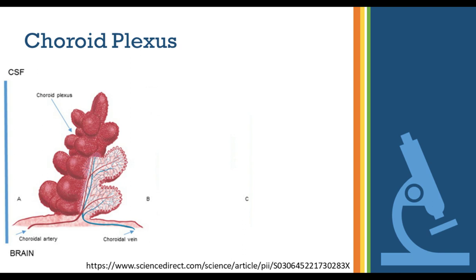Dr. Delery, can you elaborate on why you couldn't use human choroid plexus? That's awesome. Okay, so you can't use human choroid plexus because the only samples I get, I don't really know anyone out there who would voluntarily submit to an open brain surgery where we would remove pieces of their choroid plexus. And they do actually have, I believe, a human line out there. However, it was taken from a patient who had cancer in his choroid plexus, and that can affect growth rates of the cells and behavior of cells. So we didn't want to use that just because it might have different properties than a true normal choroid plexus since it was cancerous. So that's why we stayed with the next best model, the primate model.